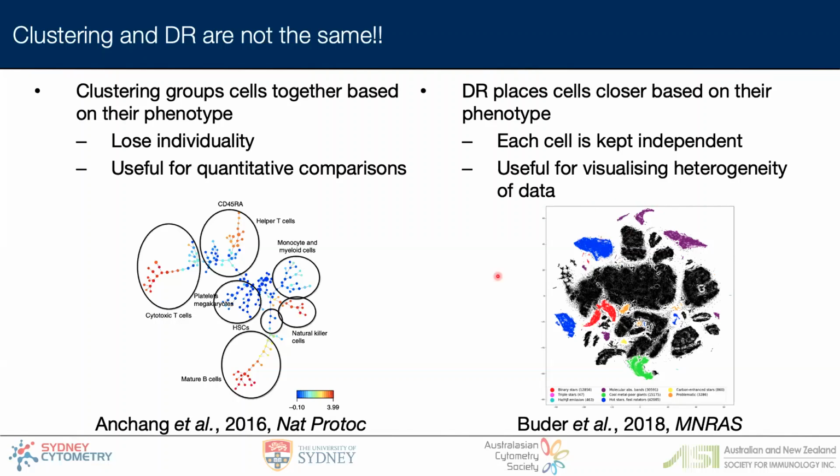And I think that's another point here as well, that the idea of clustering and dimensionality reduction is not new. These have been around for decades. It's just new to cytometrists in general. And that's just because we haven't really needed them, because we haven't had as many parameters or as many cells as we're starting to build upon now.